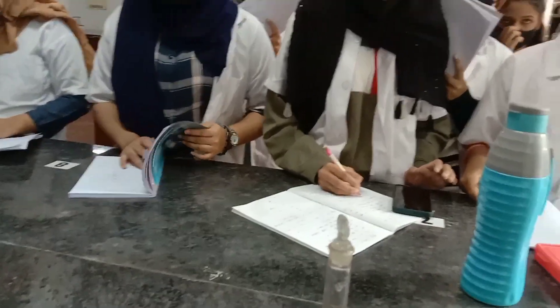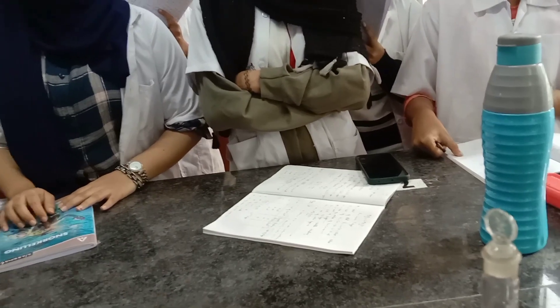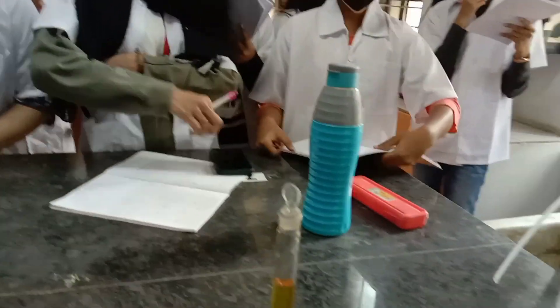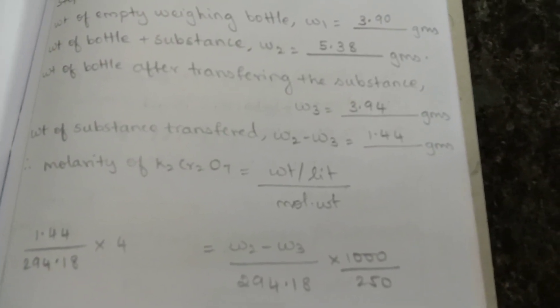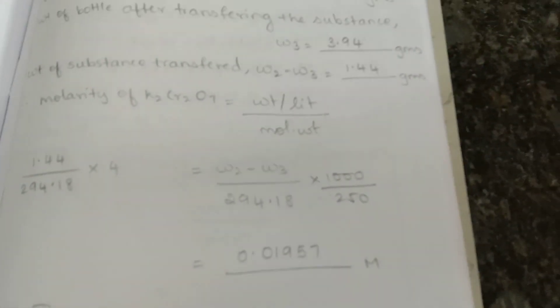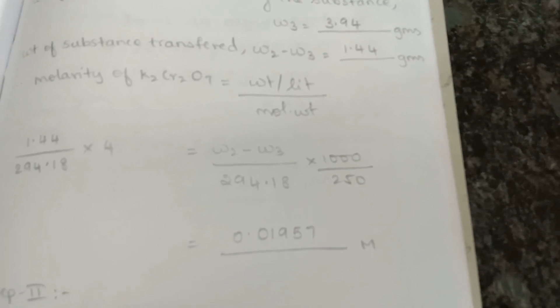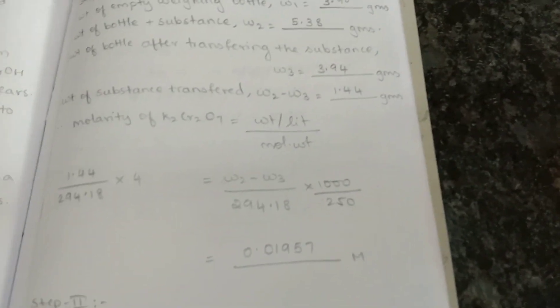The weight of the substance transferred is 1.44 grams. You can calculate the molarity of K₂Cr₂O₇. The result is 0.01957 M. Don't forget to write the units.